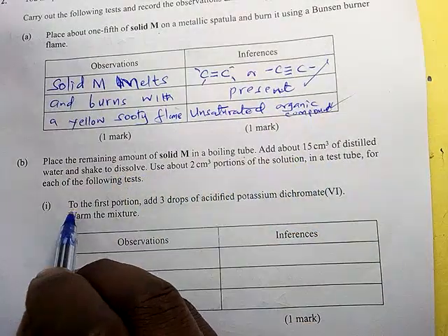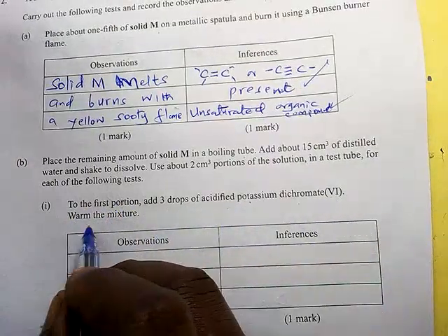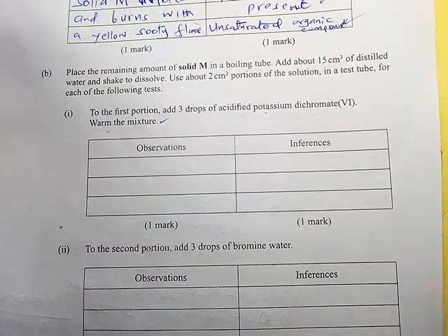The first test: to the first portion, add 3 drops of acidified potassium dichromate. Warm the mixture. So what happened?